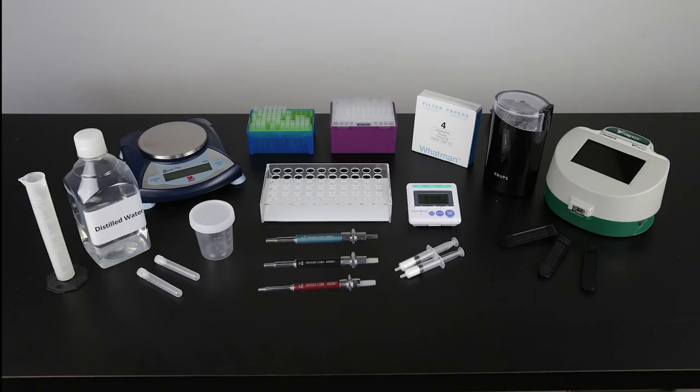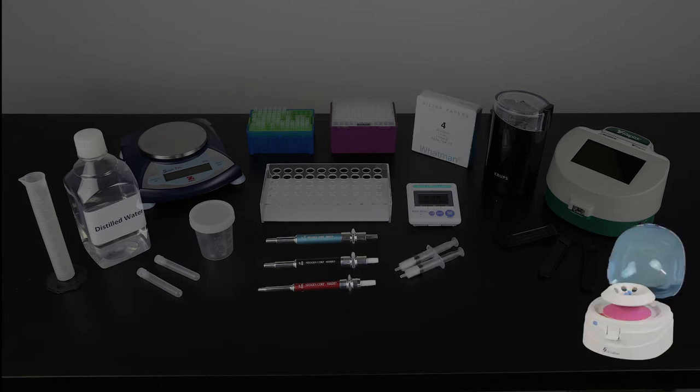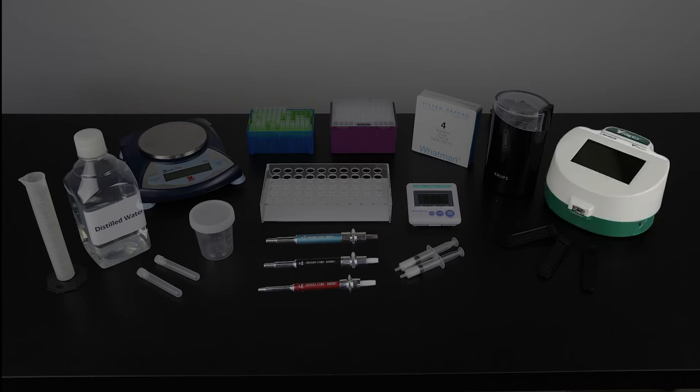To conduct the test, you will also need an Agri-Grind or equivalent grinder, a scale capable of weighing 10 grams accurate plus or minus 0.1 gram, a timer, a Reveal sample cup rack, 50 milliliter graduated cylinder, distilled or deionized water, a 100 microliter, 400 microliter, and 500 microliter pipetter and tips, sample collection cups and lids, sample collection tubes and caps, filter syringes, Whatman number 4 filter paper or mini centrifuge and tubes, a Raptor integrated analysis system, and Raptor cartridges.